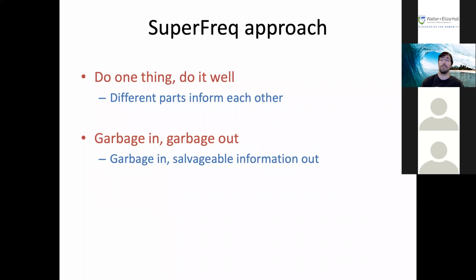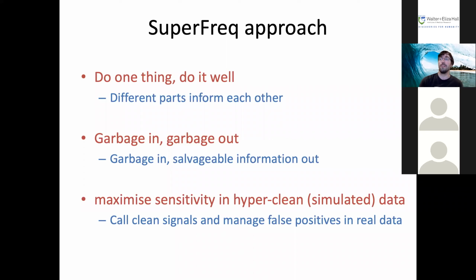So this also departs a little bit from the standard of assessing methods that tend to go to very clean samples, simulated data, and so on, with very little biases, very little noise, and then try to maximize sensitivity as much as possible on that kind of data, bringing sensitivity from like 95 to 96% and so on.